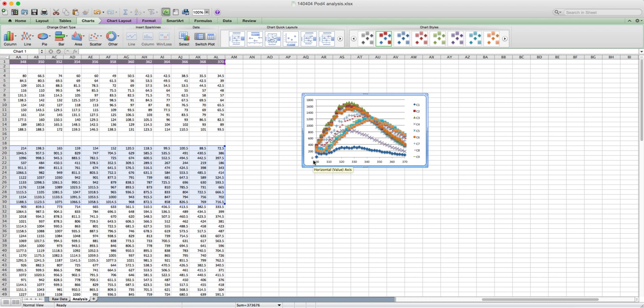One of the first things that I noticed looking at this graph is that you have this one curve that's pretty much flat down here. The height of these curves corresponds to basically how much protein you have. Remember, we're using fluorescence of the tryptophan, which we know absorbs at 280. We've used absorbance at 280 before to measure protein concentration, right? You know that that's directly proportional. So if you have more protein, you're going to see higher signal. Less protein, you're going to see lower signal. So it looks here like there's very little, if any, protein that got into this well.